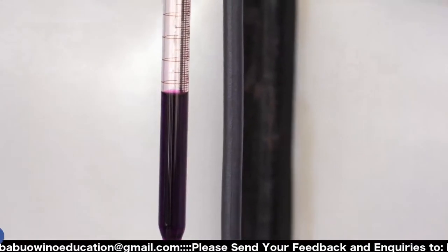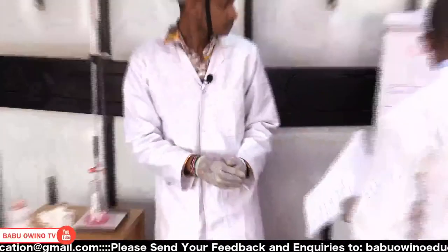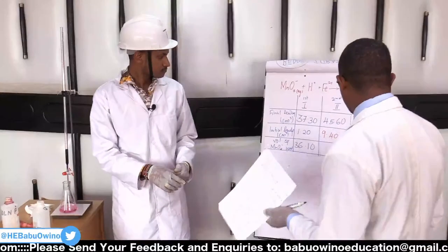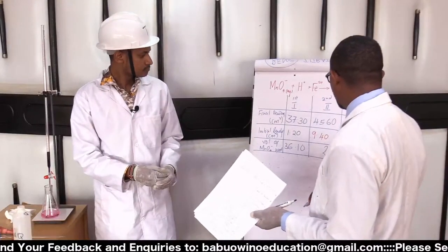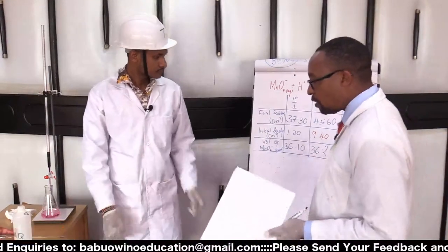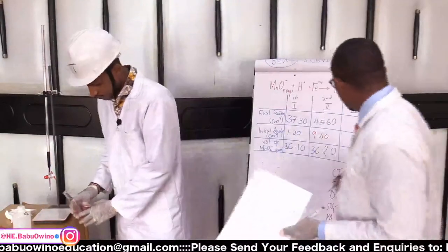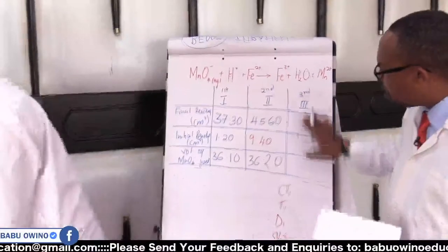So read for me. That's 45.6. So 45.60, consistency in the decimal points. So this gives you 36. Do we have another solution for another one? Let's confirm. Refill. We want to see whether we'll be consistent.